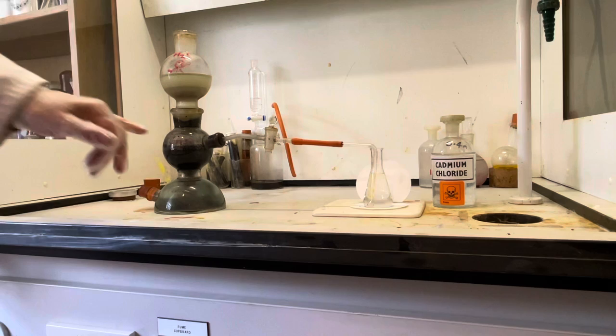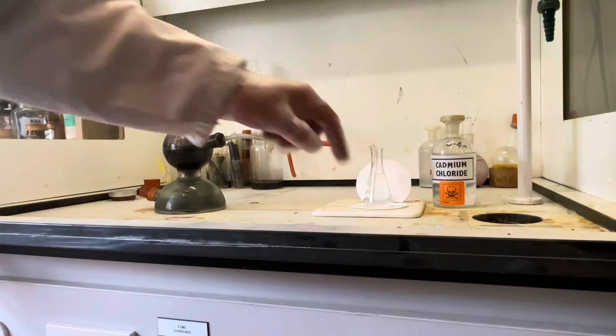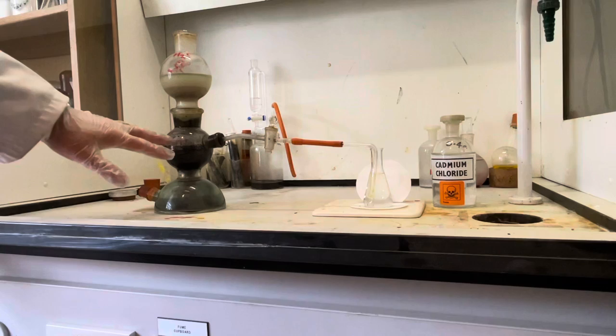It's exactly the same one. It's filled with iron sulphide and then filled with a very strong solution of hydrochloric acid, which generates hydrogen sulphide. We're going to pass hydrogen sulphide through a delivery tube to bubble through some cadmium chloride solution, which will precipitate cadmium sulphide — a very beautiful colour, unlike the black substances that so many sulphides are.